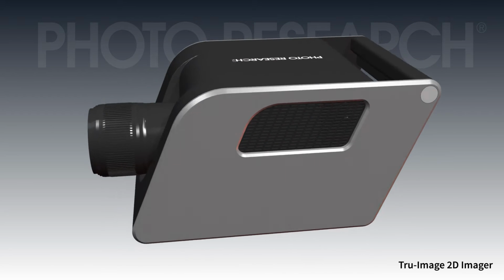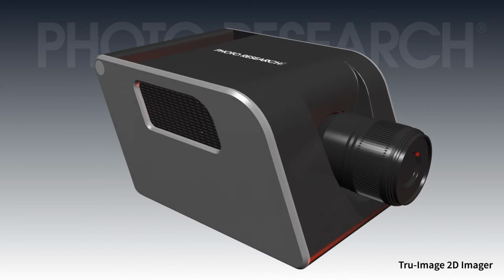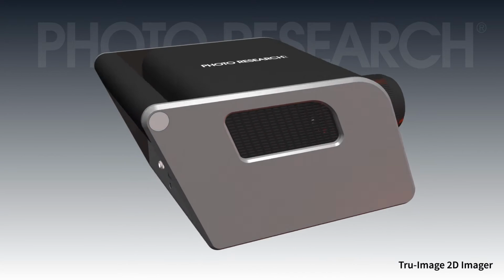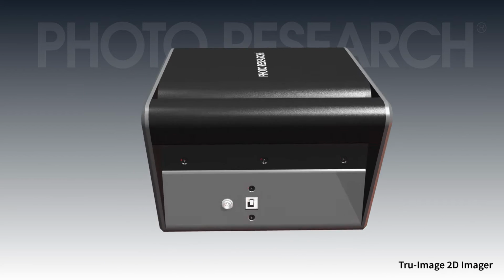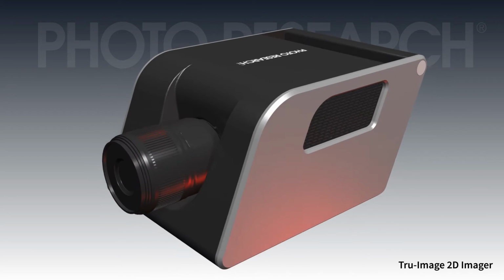The Tru-Image has been designed for ease of use and versatility, and offers significant time reduction compared to measurements with traditional spot-based systems. This 2D imaging solution helps reduce significantly measurement times relative to traditional spot-based instruments.